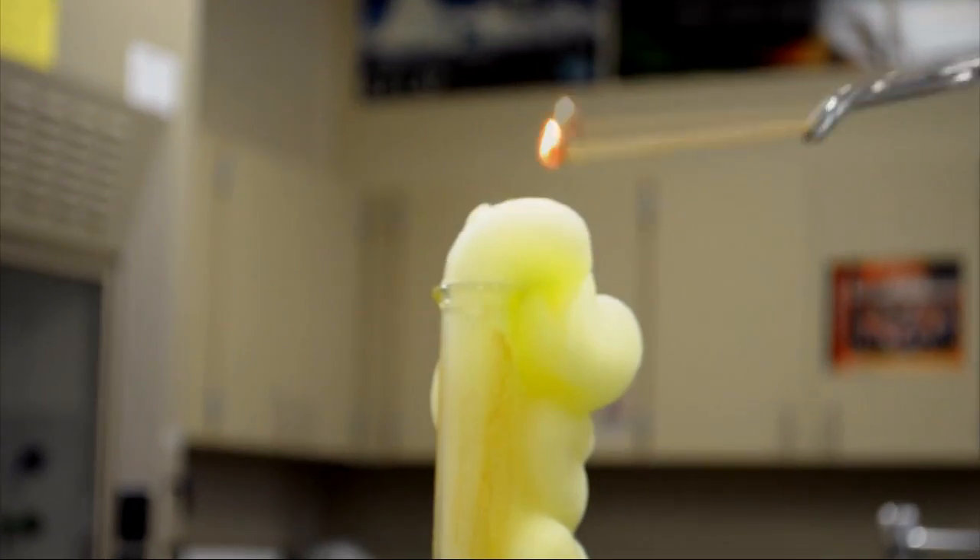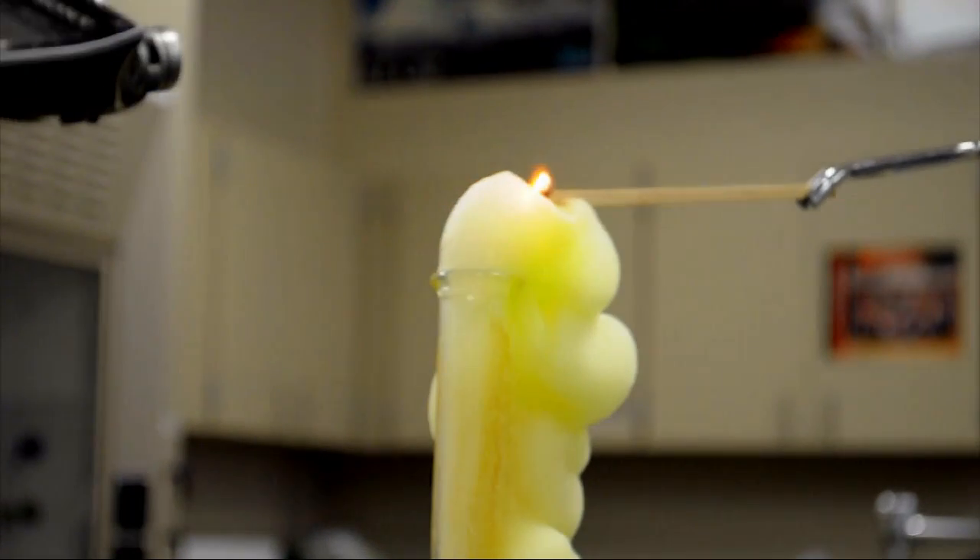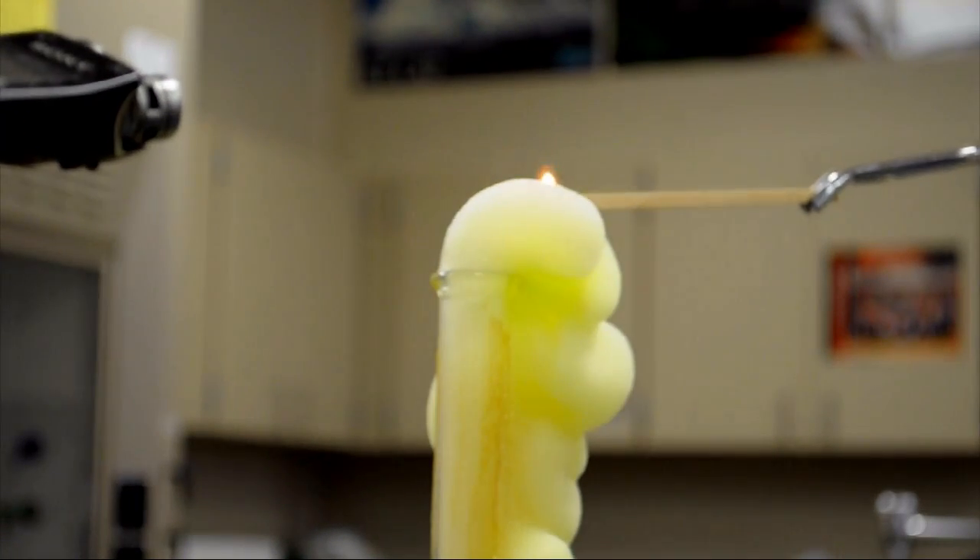The splint placed on the foam relights because of the released oxygen gas. That was great. Let's do it again. And now you get the toothpaste effects.